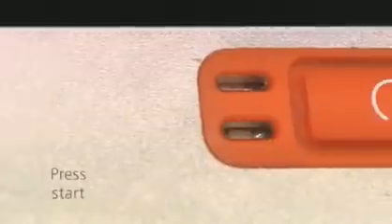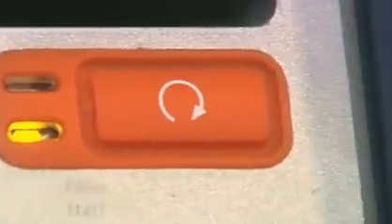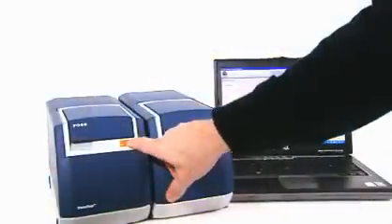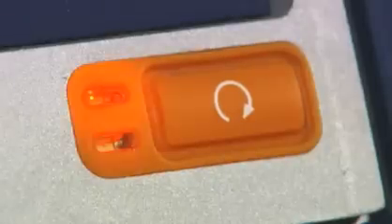Wait for the flashing green light and then press the start button to start your analysis. The last stage of the closure occurs automatically.